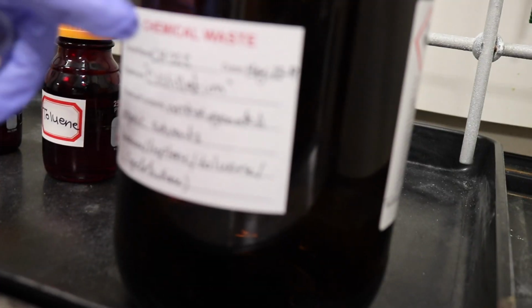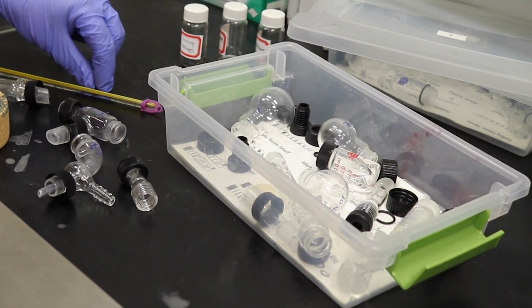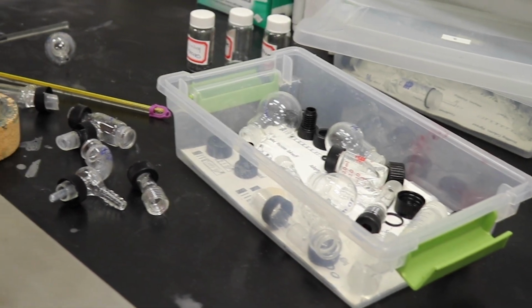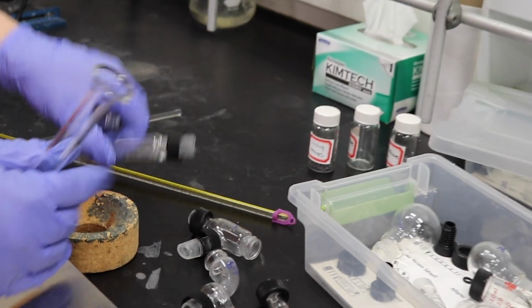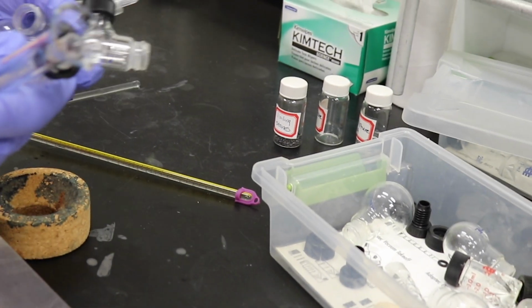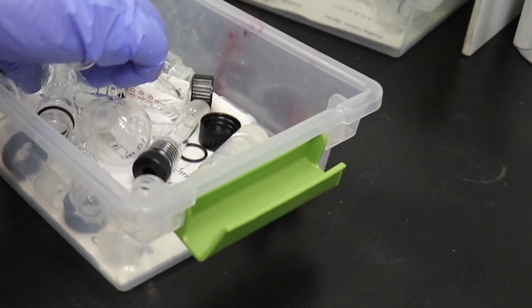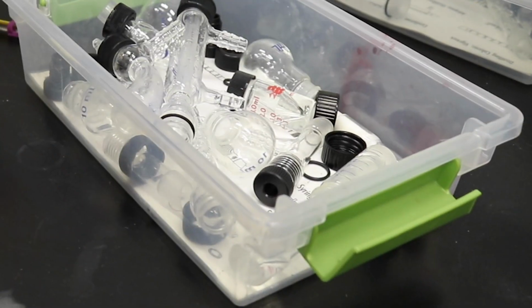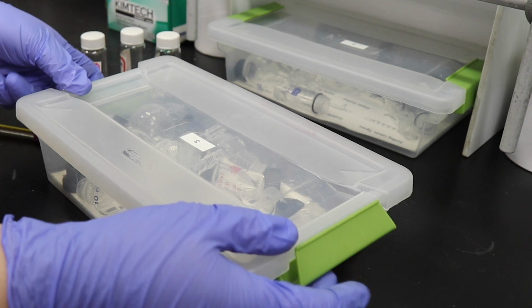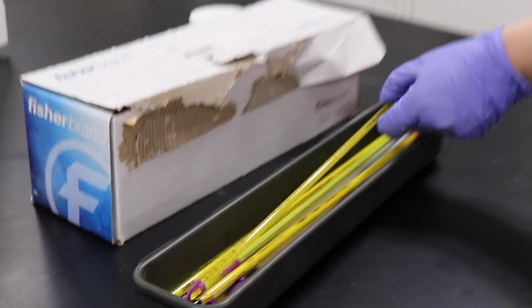And now we put back all of our O-rings, and then we take all of our glassware over to the sink and make sure we wash it. Once our glassware is washed and clean, we take it back and put it into our microscale kit, close it up and put it away, and put our thermometer back, and now our distillation is done.